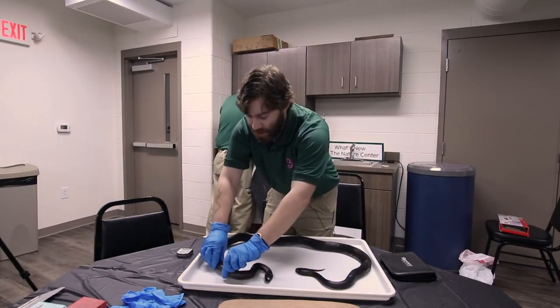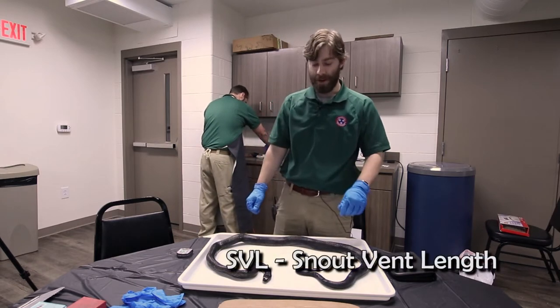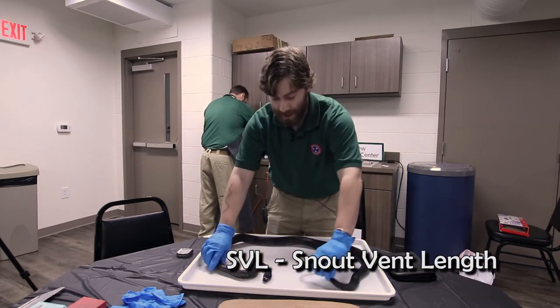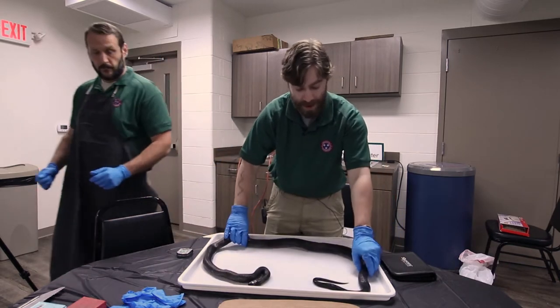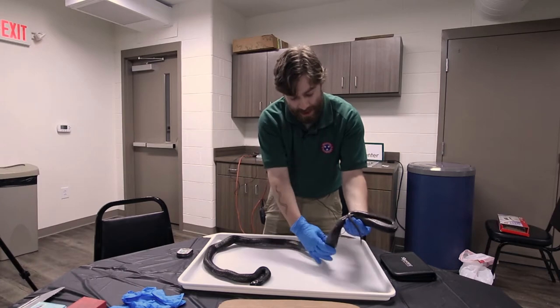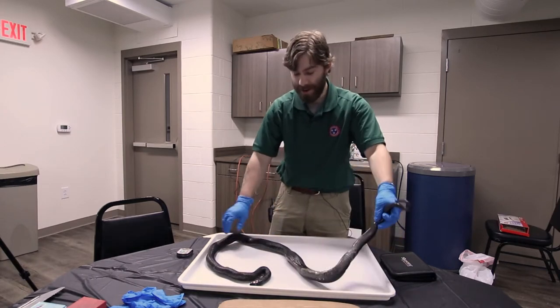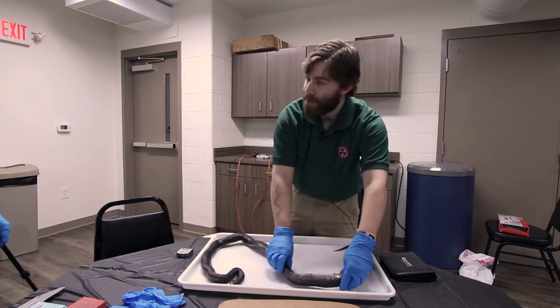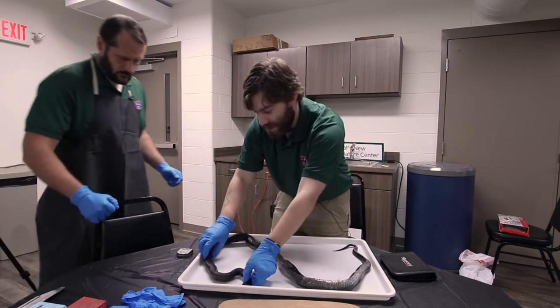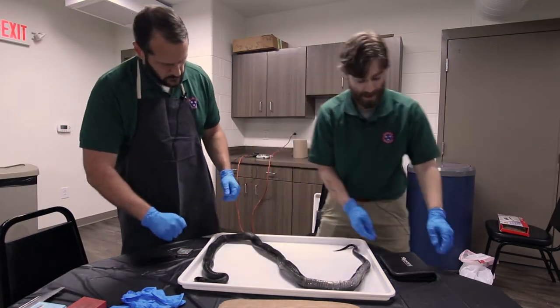Next we're going to take some measurements. Usually there are two measurements that we do with snakes. One is snout vent length, abbreviated SVL, and one is total length, which is the total length of the animal. SVL is from the snout, from the nose, all the way to the vent, which is also the cloaca, the opening at the back where they go to the bathroom and lay eggs and all that stuff. If you wouldn't mind helping me measure this snake, I'm going to have to do it in sections since it's not straightened out.